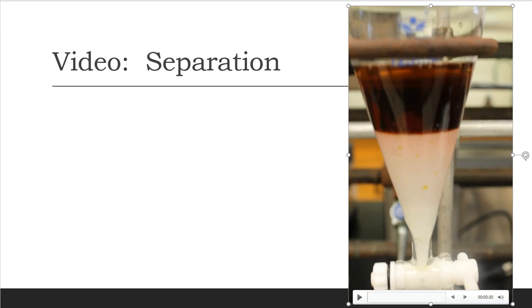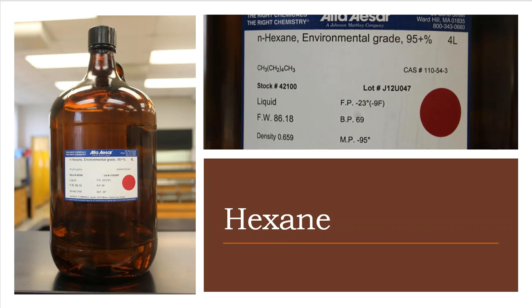The lab directions, as I pointed out before, told me to use a little bit of hexane before I begin to drain these two layers, to aid in the transfer process. So I did have some stuff left over in the boiling flask. Here's the hexane that I decided to use. Why do they tell me hexane? Well, as you can imagine, we are trying to drive off hexanol: 1, 2, 3, 4, 5, and 6 carbons with an OH group. Hexane is just simply hexanol without the OH group. So that is why they tell me to use this out of everything. It's not going to interfere with hardly anything that we do from this point on.